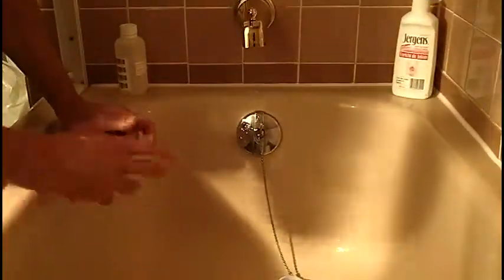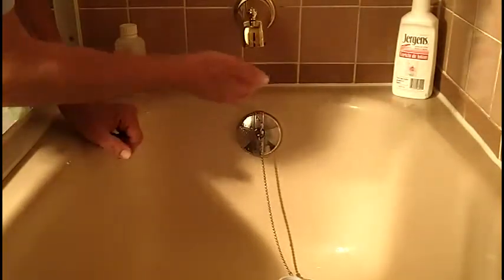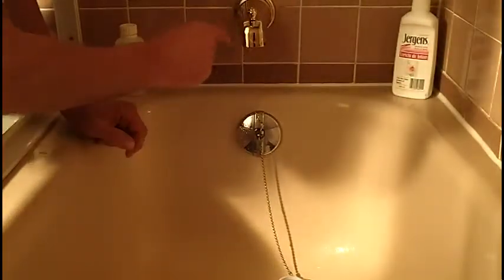The best place to take a water sample to test for bacteria is a bathroom faucet like this one here. You've got great flow of water and there's no screen in there to affect the water sample. So what we need to do first is disinfect this faucet here.